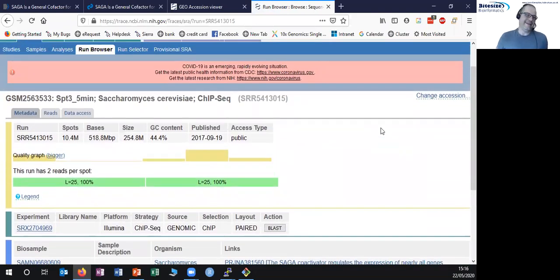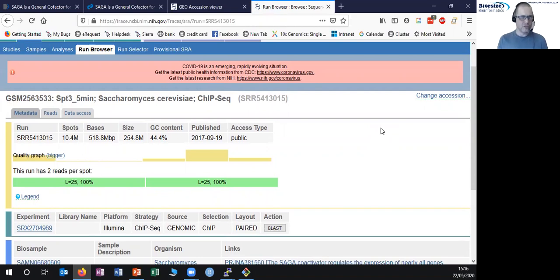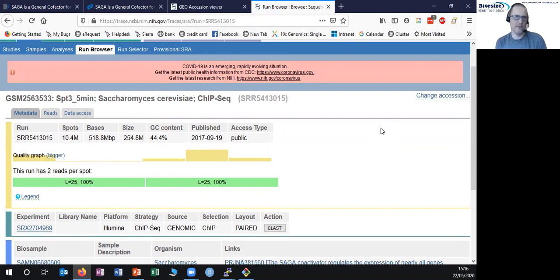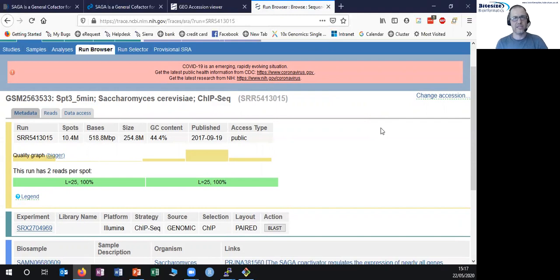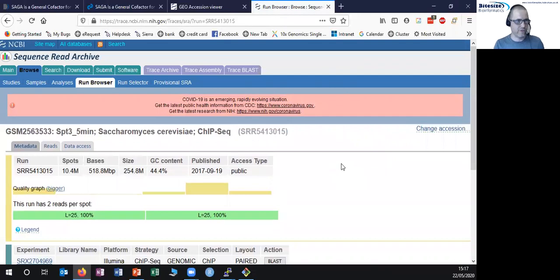Getting FASTQ data out of a database designed to store FASTQ data, you would think would be a simple process — but oh boy, is it not. We're going to look at how to do this, but I warn you this is going to be a slightly painful journey. I'll show you a few different routes through this, but it is not the easiest thing in the world, and I completely understand people who get frustrated trying to get data out of here.